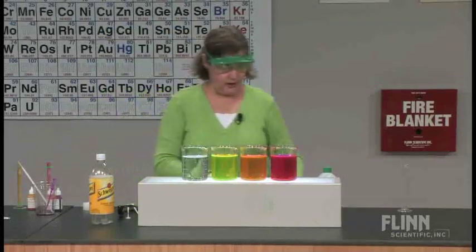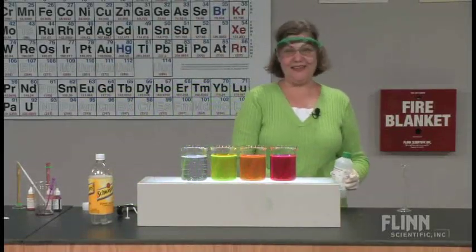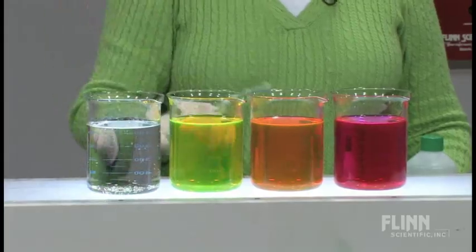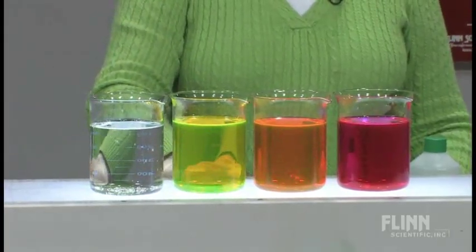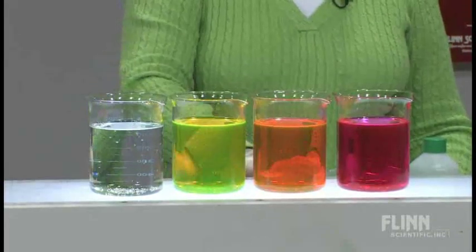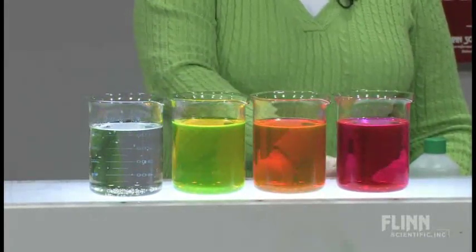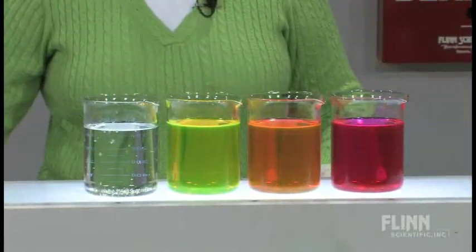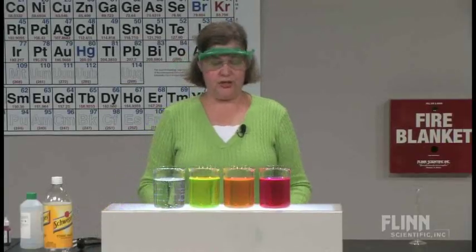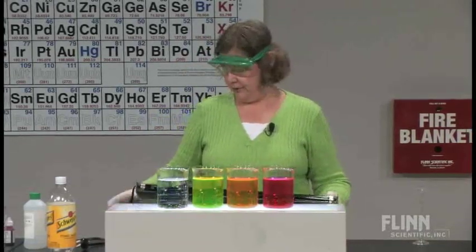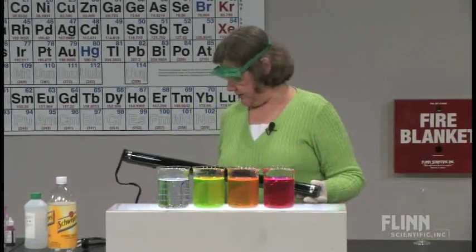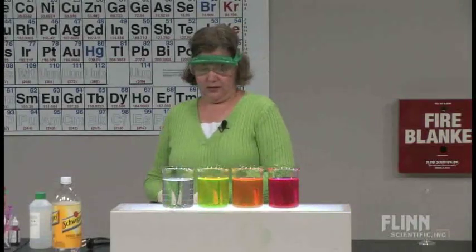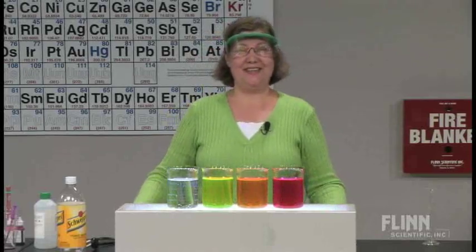First, let's note the colors under white light. The quinine is colorless in visible light. The fluorescein is its characteristic yellow-green color. The eosin is a bright, bright orange, and the rhodamine is fuchsia or pink-red-violet. Now the question is, what does that look like under black light? Let's dim the lights.